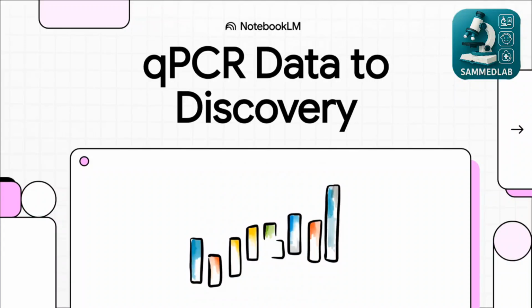All right, let's dive in. Today, we're going to talk about turning that mountain of raw qPCR data into actual discoveries. We'll take a tour of the CFX Maestro software to see how it can simplify and speed up that whole process, helping you find the biological story hidden in the numbers.